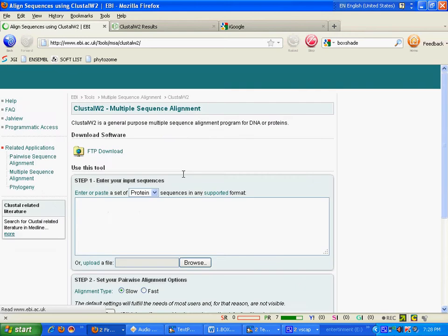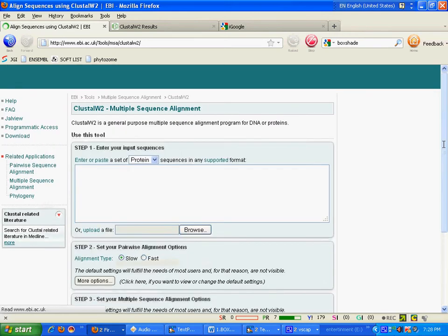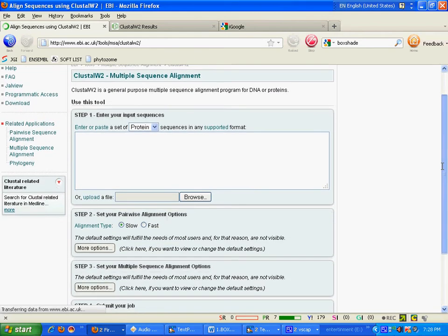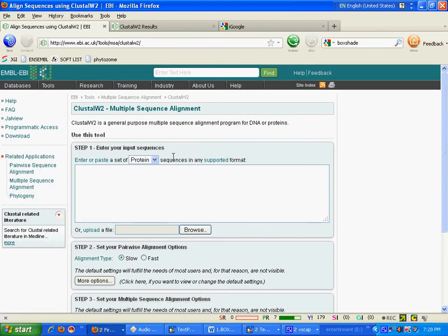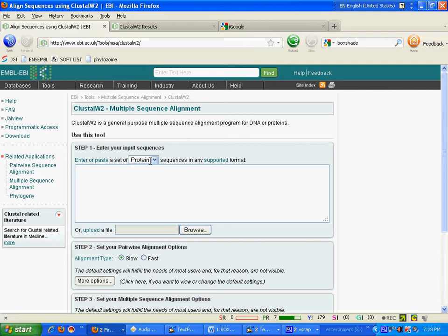This is the ClustalW hosted on EBI server. Here you can choose your sequence type. I am going to use the protein sequence, so I choose protein.